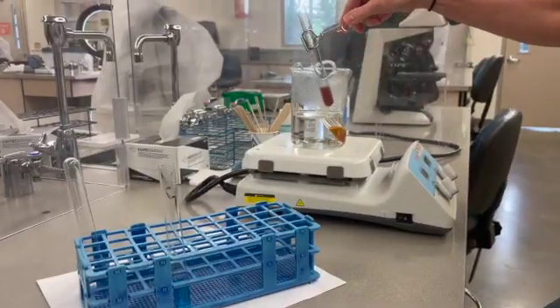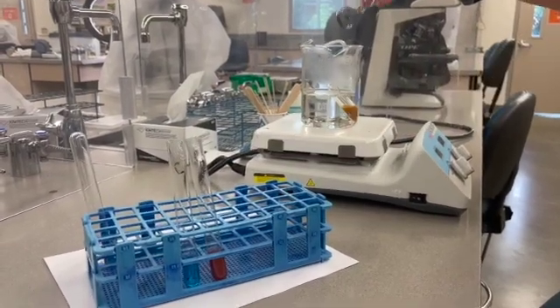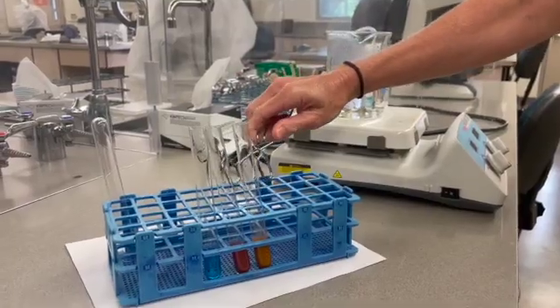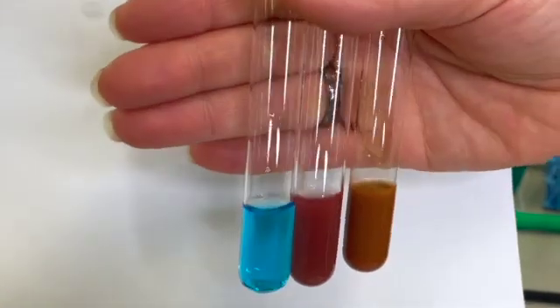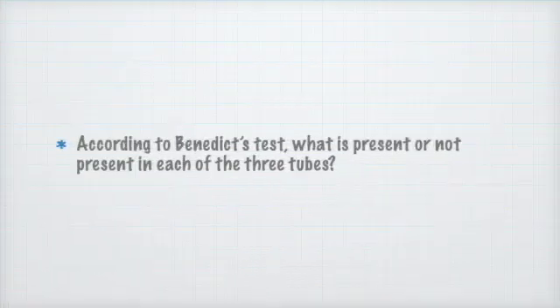We remove the test tubes from the boiling water and make notes of any changes we observed. This is the end of Benedict's test. Test tubes are left to right, control, beaker solution, and dialysis tubing solution.